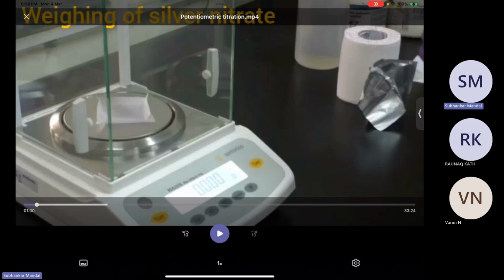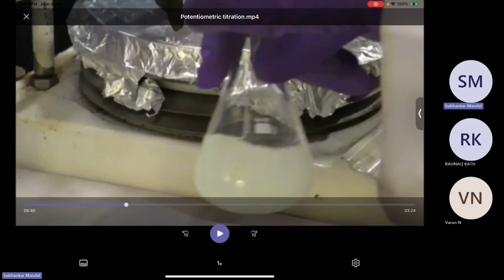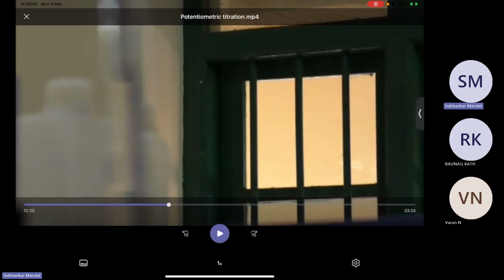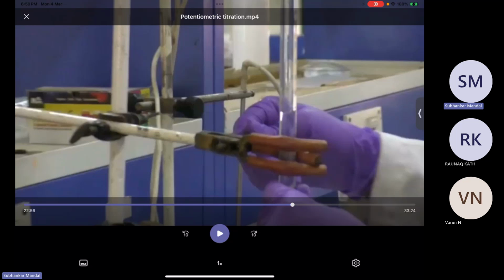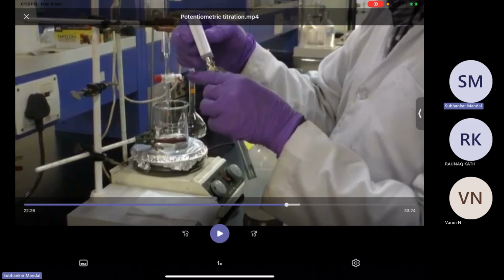So this is how students can do all the measurements. I will go directly to the Pasco meter. This is the titration where we are just standardizing the silver nitrate solution with standard sodium chloride, because sodium chloride is the primary standard and silver nitrate is standardized against the primary standard. Yeah, this is the Pasco electrode. So this is this kind of thing.